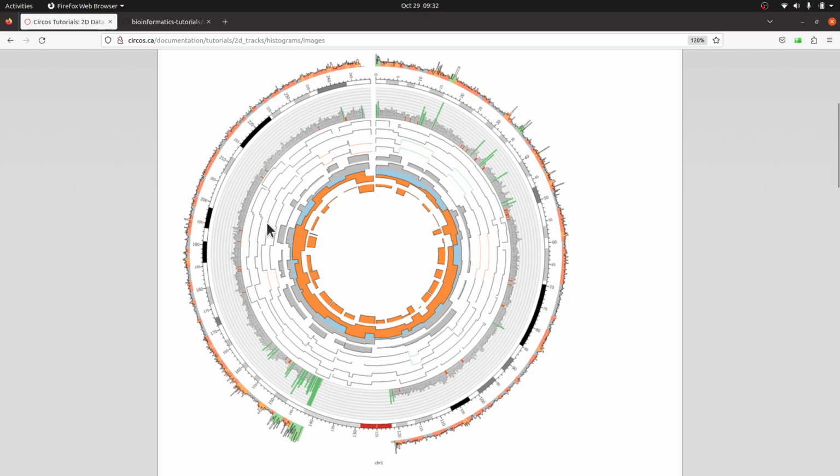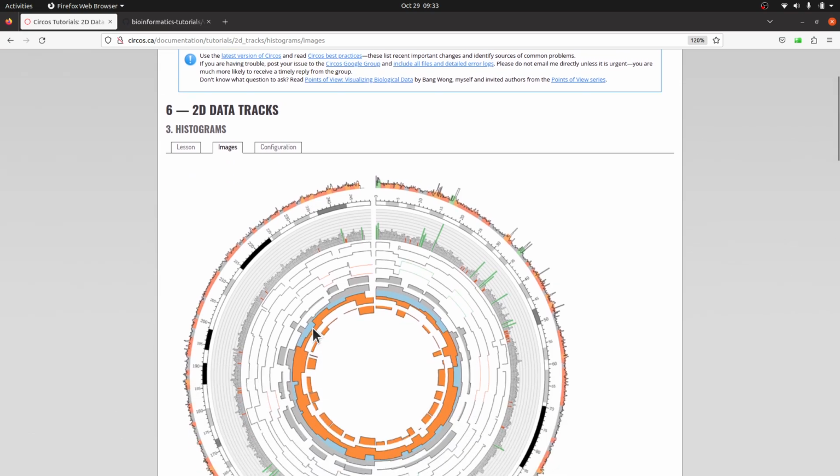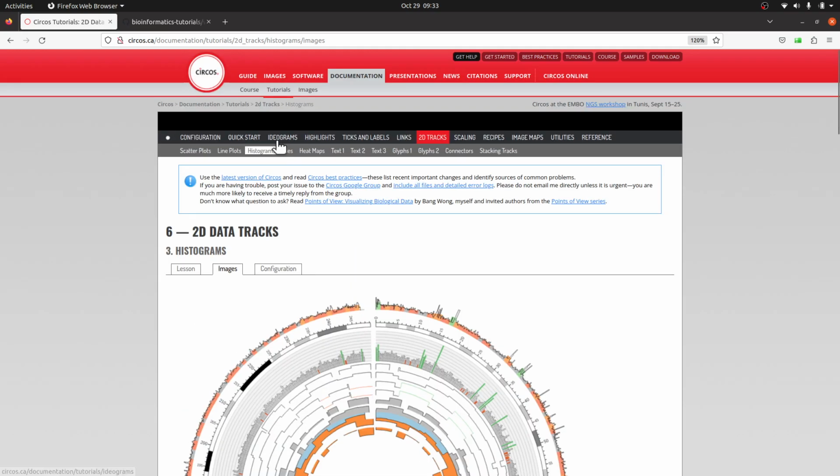We are going to generate a histogram such as this one here. There are different histogram types, but you have to read and then decide what you want to do. We are doing the basic one to help you get started, but for complex ones, we will later look at them. I'll treat them in separate tutorials. For now, just read the instructions on this page if you want to read more about how to generate histograms. It's very, very simple once you know your way around it.